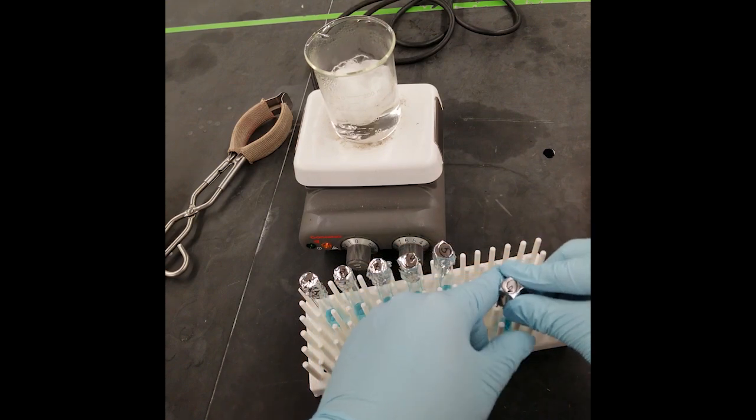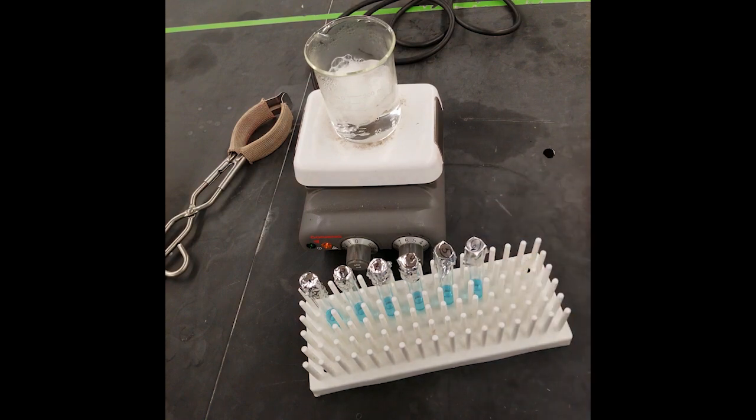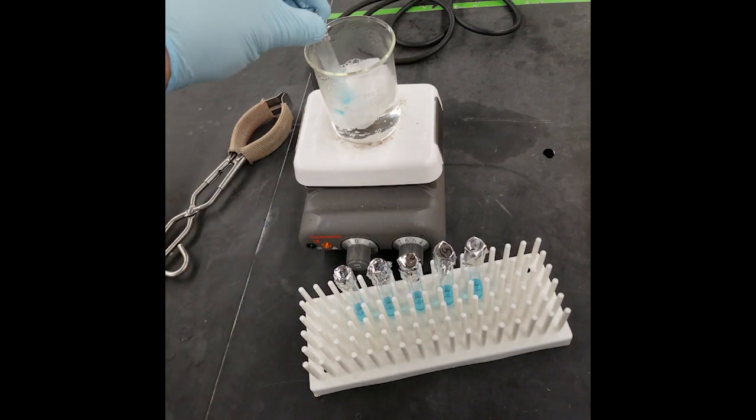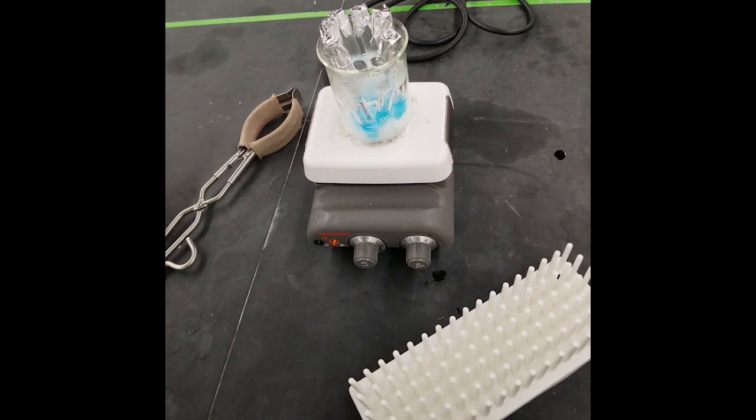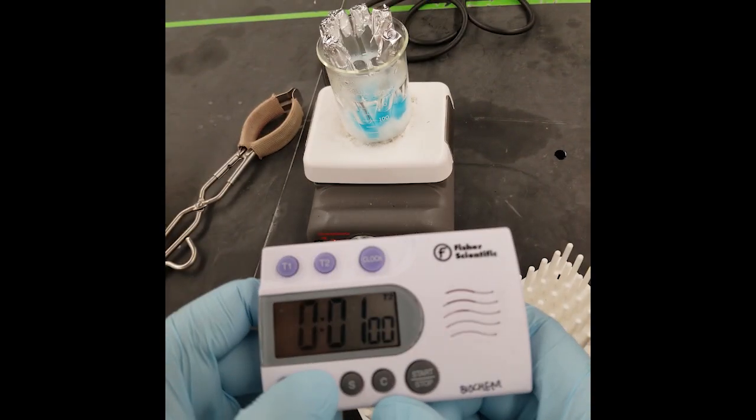After securing the foil over each tube, gently place each individual tube in the boiling water. The cheesecloth here is to protect any tubes from hitting the bottom of the beaker too aggressively. After placing the last tube inside the beaker, set a 20-minute timer for the boiling step.